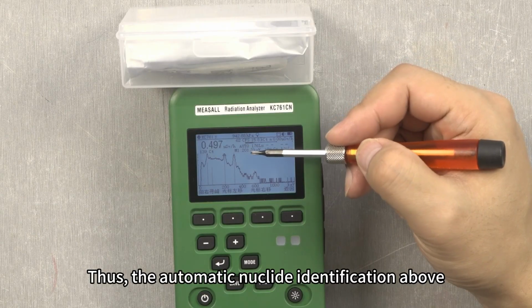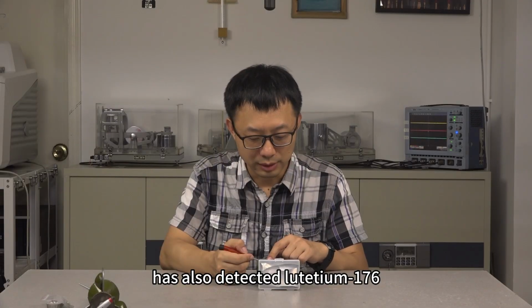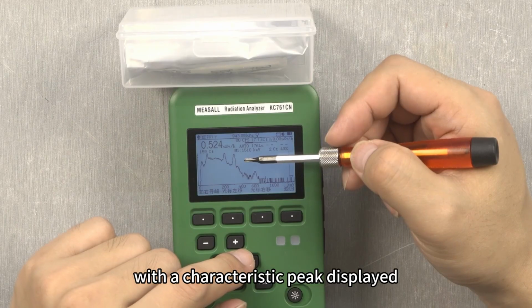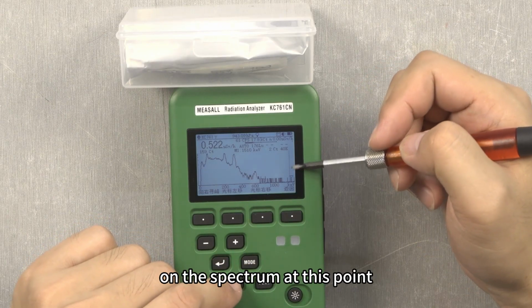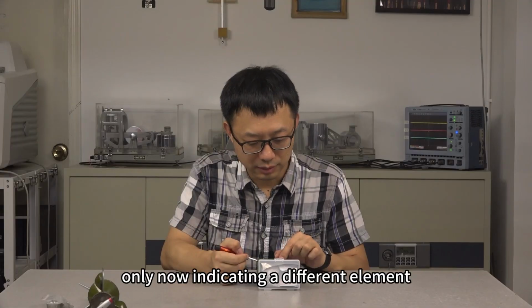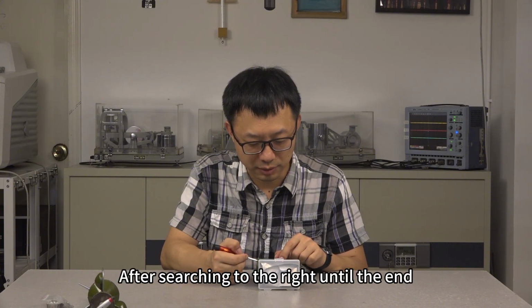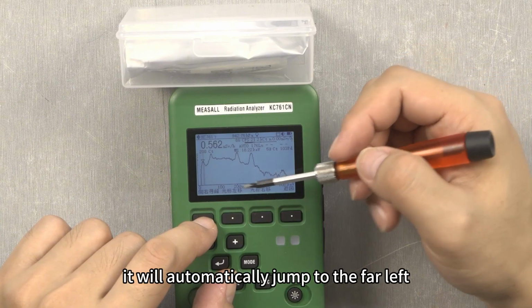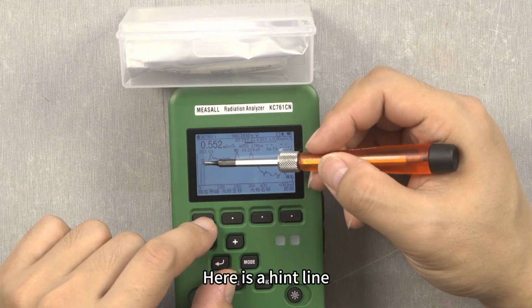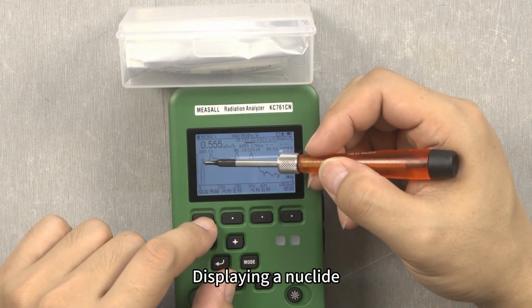lutetium-176. Thus, the automatic nuclide identification above has also detected lutetium-176, even if the cursor is not aligned with the characteristic peak displayed on the spectrum at this point. The cursor's prompt line remains visible, only now indicating a different element. Return to cursor peak search. After searching to the right until the end, it will automatically jump to the far left. Alright, the first peak. Here is a prompt line, and there appears to be something resembling a peak, displaying a nuclide.